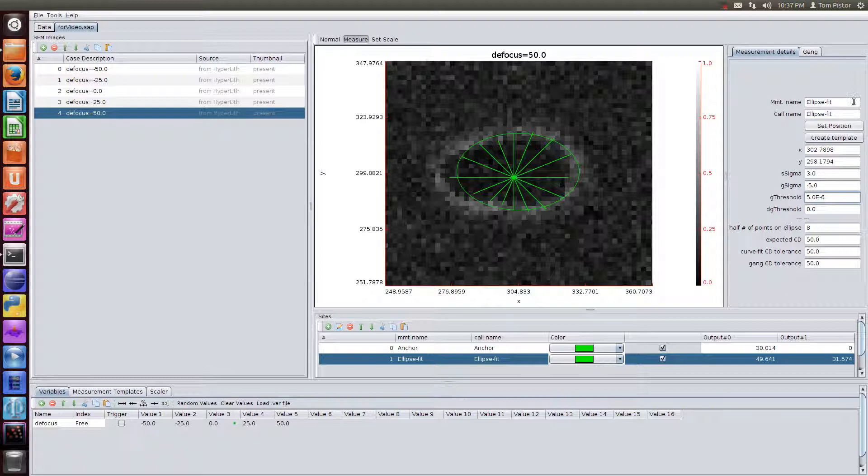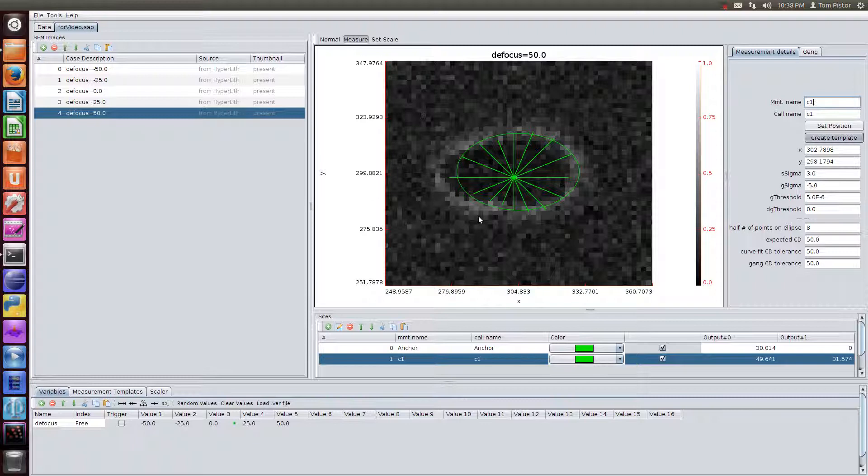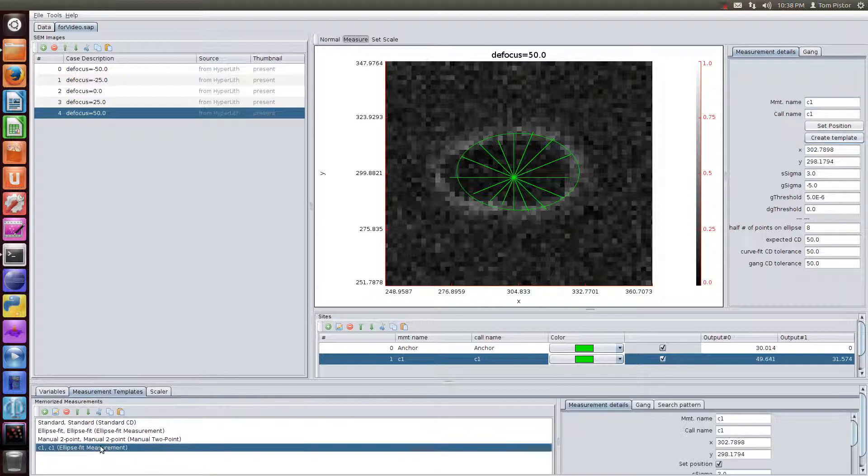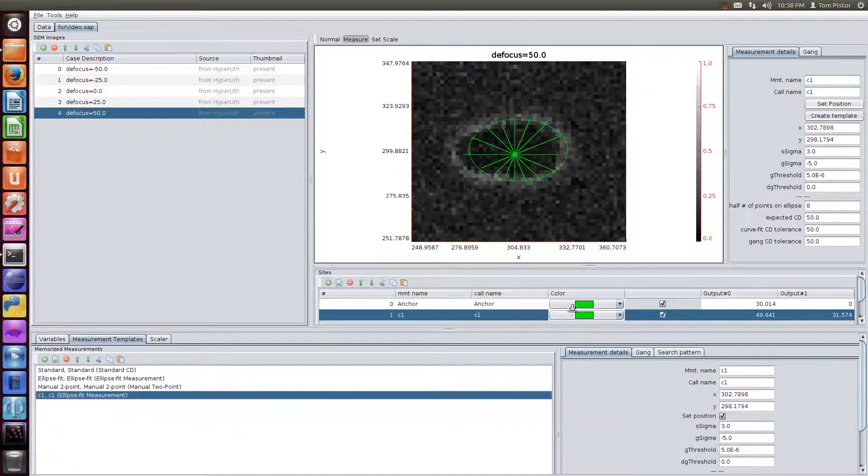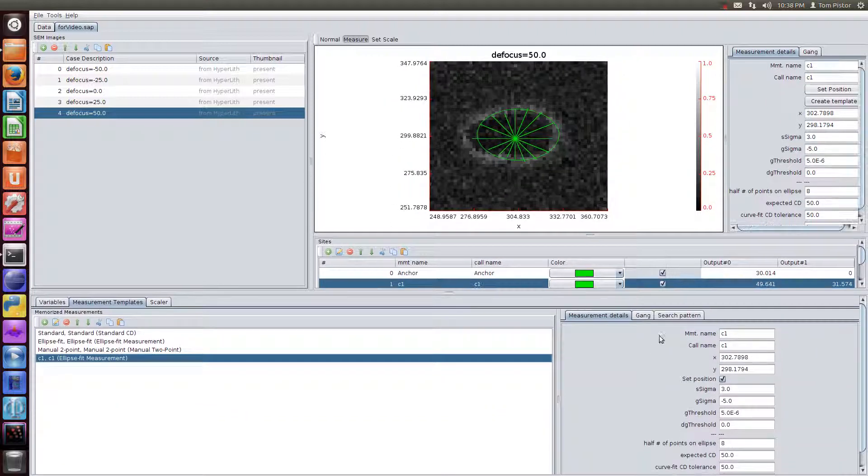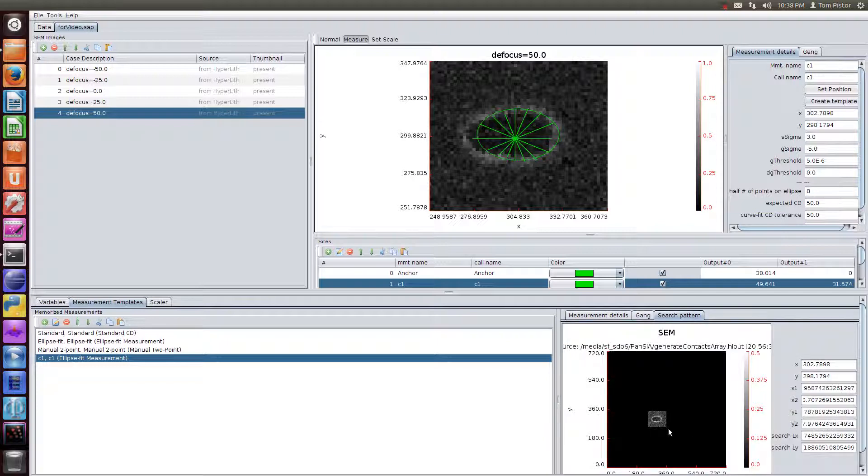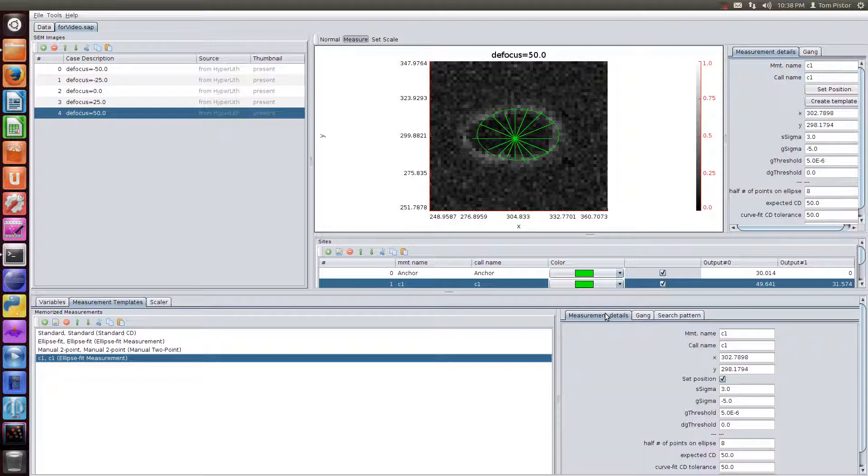We'll call it just a simple name, C1, just so that we can recall it easily. And we'll create a template. So when you create a template, it sets a search pattern based on this and puts it over here. So now we have a template which we can apply to all of the other SEM images. So there's the search pattern, and there's the position details.